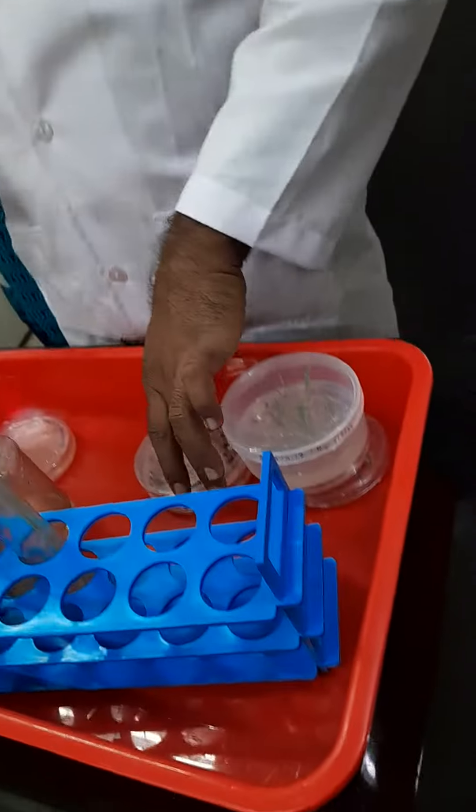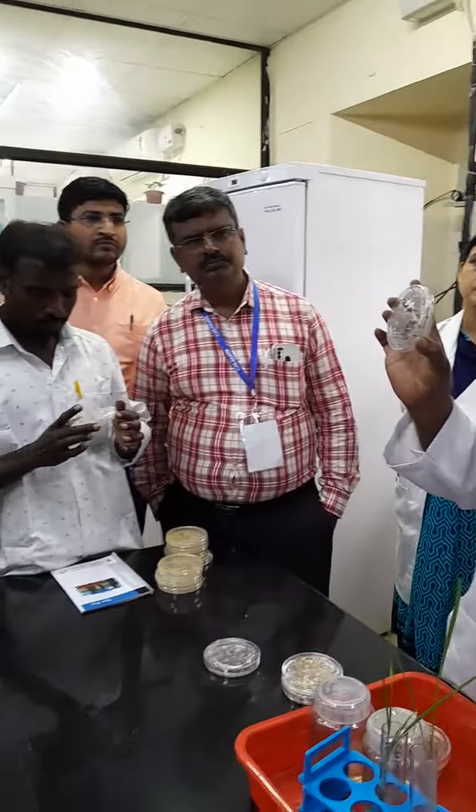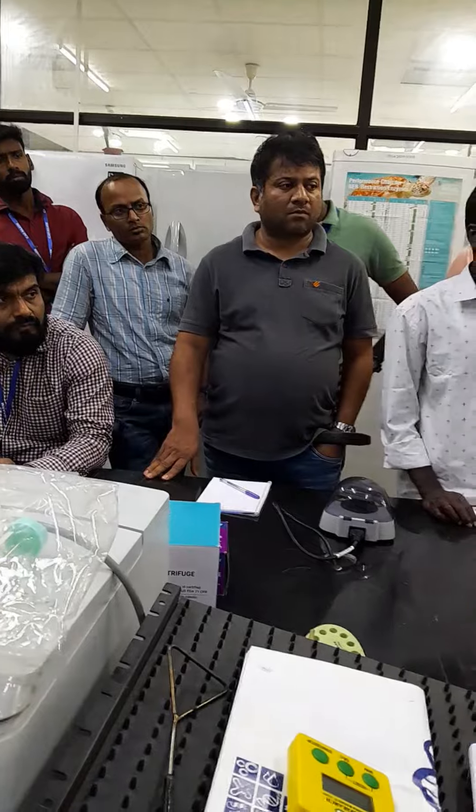So this is what it looks like in first selection — they are going to die. So nearly these are in third selection. So many are dead, but again those that are infected with your construct and having the hygromycin resistance are alive and regenerating, so you can see those bits right now.